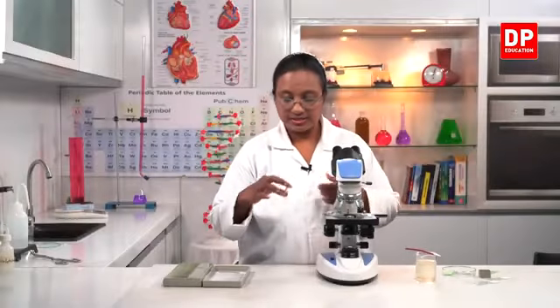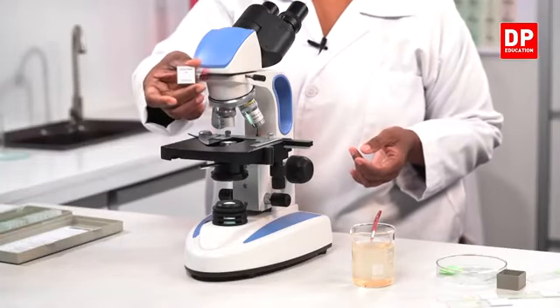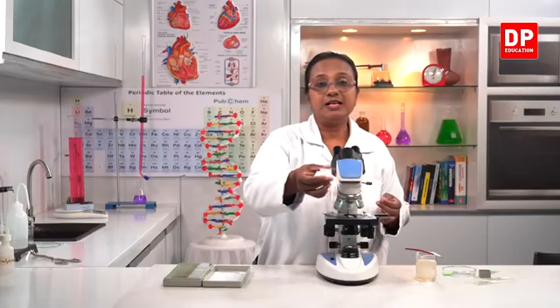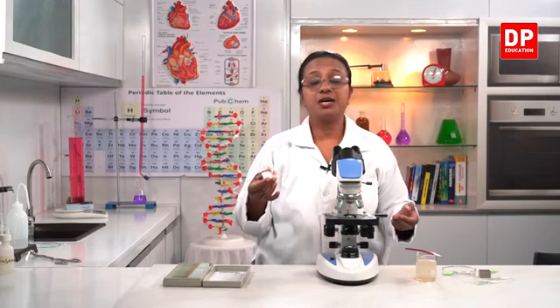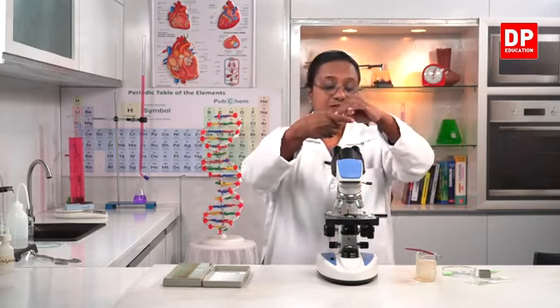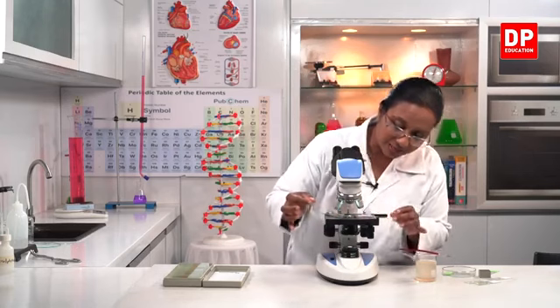Now this is the permanent slide of a heart. You all can see that clearly. So in this, what happens? The cells combine and form the tissue, and the tissues combine to form the organ. So I will observe this under the microscope. Again here, first under low power.